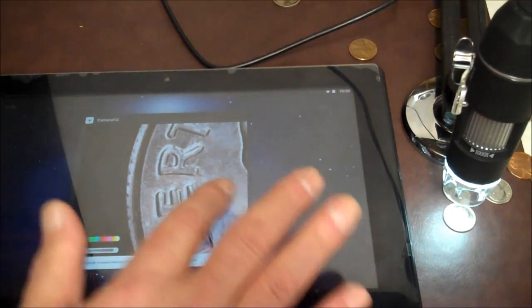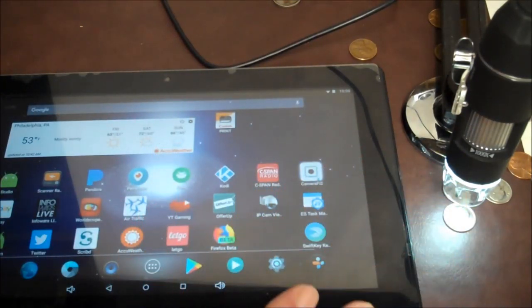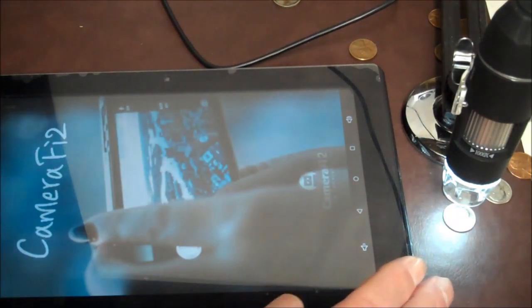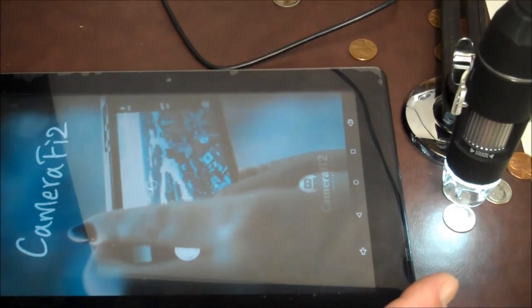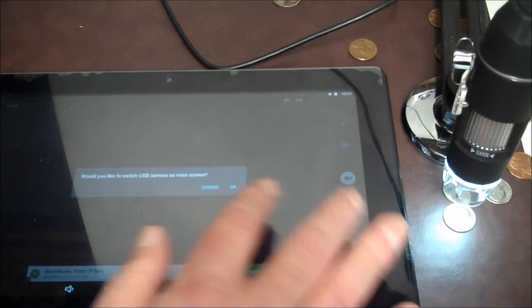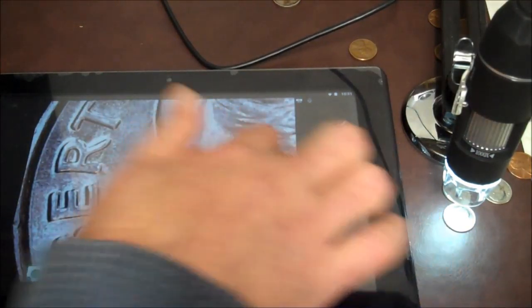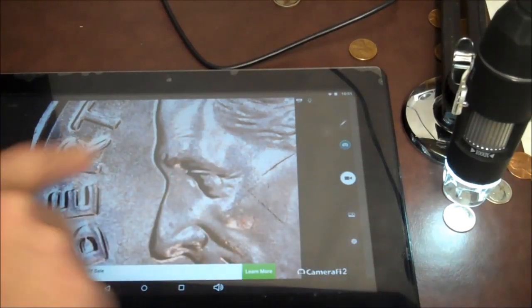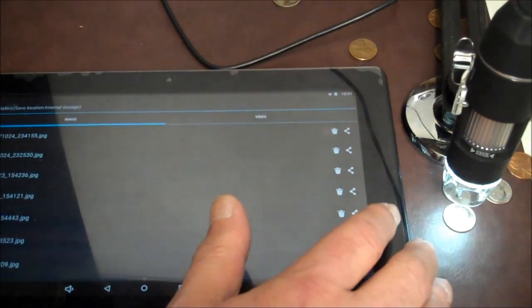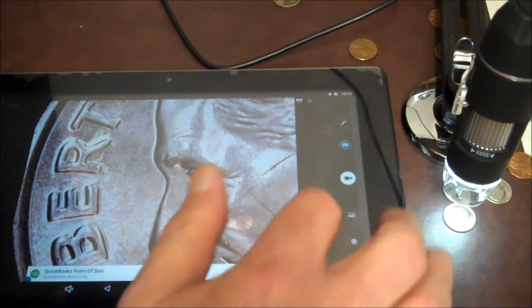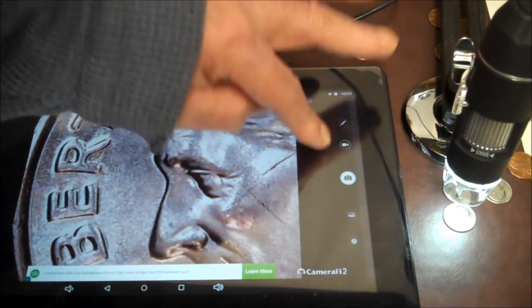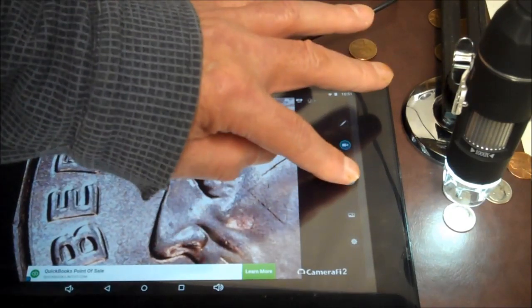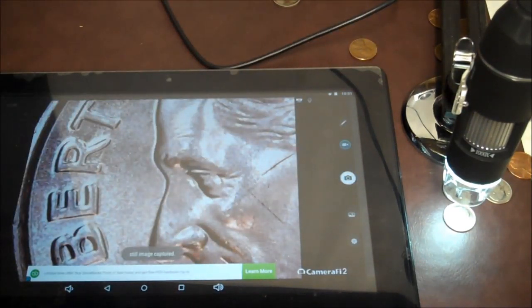Alright, so what I think I gotta do is start it over again. So let's try that Camerify 2. Yeah, some, these cheap cameras, they're okay, but they ain't really worth it. That's a shit. Yeah, it ain't working. Anyway, there was a thing that I could slide from the edge here with filters and stuff on it. I even took pictures with it. Now it won't work. Oh boy. Well. That's about it for this guy.